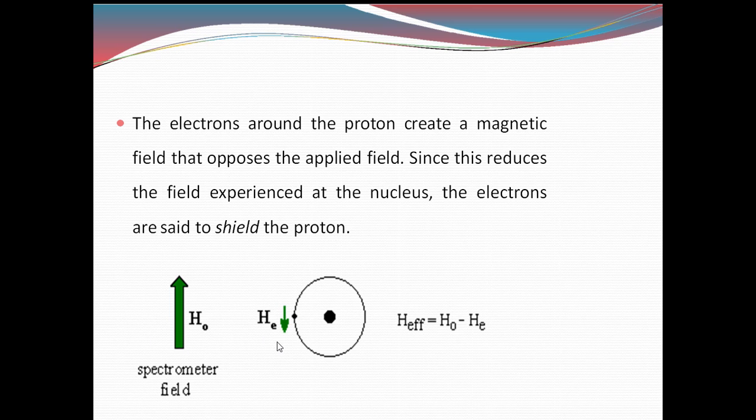So what is the principle in NMR? The NMR spectrum will be formed from the molecule only when it shows two different spin states. And NMR spectrum is possible only when the molecule absorbs radio frequency. When does it absorb the radio frequency? Only when it shows the two spin states. It shows the two spin states only when there is an external magnetic field. So the external magnetic field should be sufficient so that it will differentiate the two spin states.